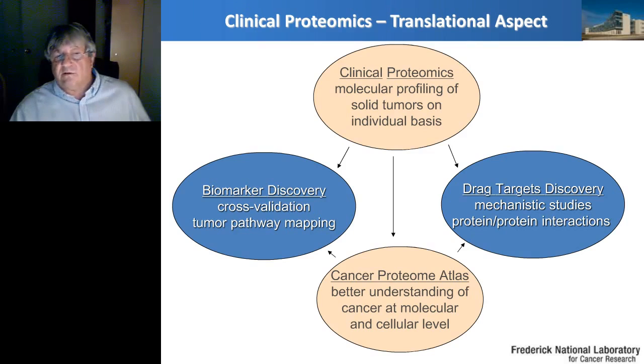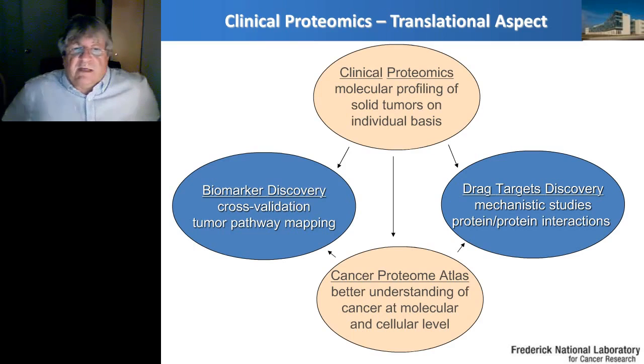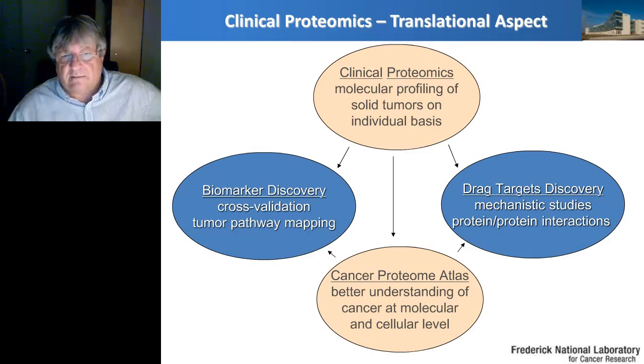Obviously tumor heterogeneity, which I didn't mention, is a big issue. Every tumor, although we classify it as, for example, renal cell carcinoma, has an individual signature. So the more tumor tissue samples and blood samples are analyzed the way we propose, the more information we can see, not battling then N of one, but N of many, to get closer to the novel biomarkers and drug targets.